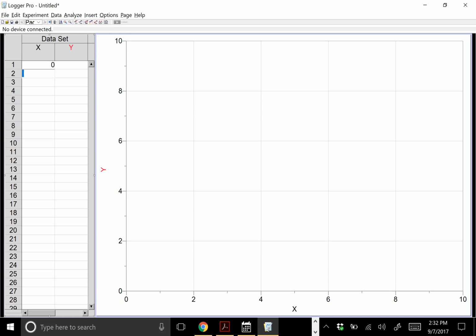In the sugar lab, you made four different solutions, but actually one of those things that you pipetted a 10 ml aliquot of was water. So I'm going to start with water: weight percent sugar of water is 0. And then we had 2%, 4%, 6%, and 8%. Now, are these really the percents of sugar? No, but I'm just pulling them out of the top of my head.